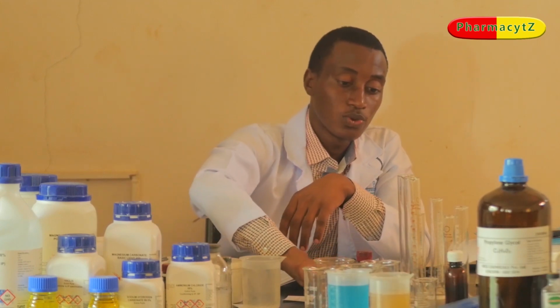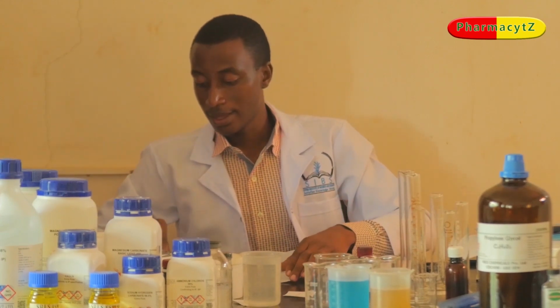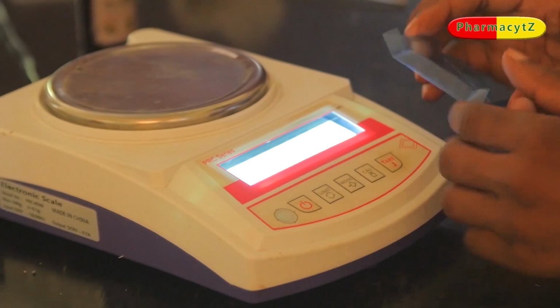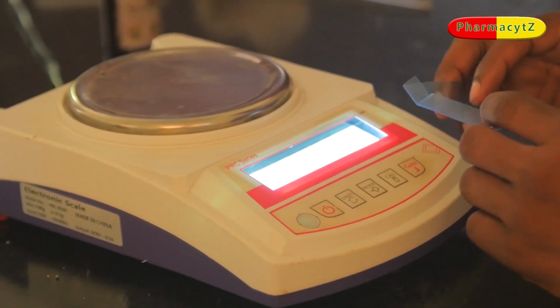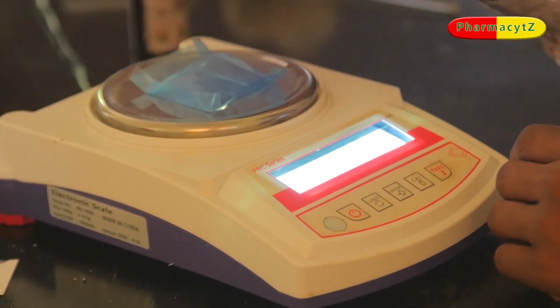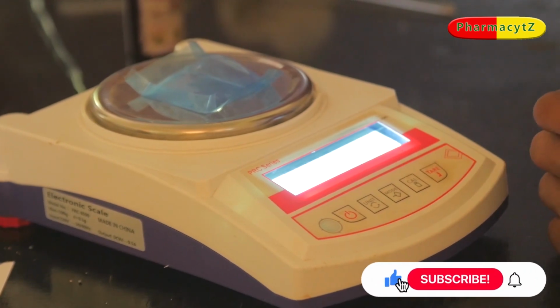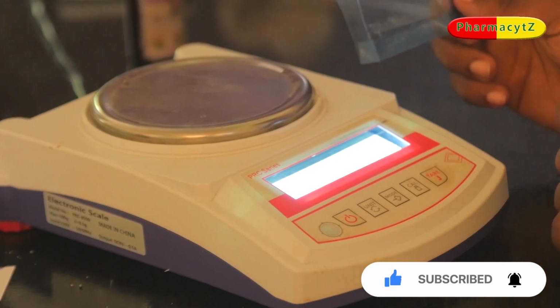So I'm going to weigh the appropriate amount of iodine using my electronic balance here. I'm going to weigh 1 gram of iodine crystals. Put your film on top of your weighing balance. After putting it, you should tare to 0. And maybe before putting anything here, you should make sure it reaches 0.